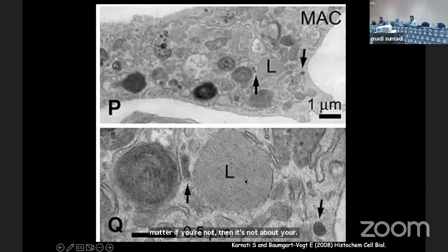So one of the difficult parts of TEM is that you need a very good understanding of cell biology. Because when you cut it and look at the microscope, you don't know where you are. You don't even know anything. You need anatomy, histology and cell biology, and then you can understand where you are. So doing the work is one thing. You can say 90% is the laborious work, and another 90% is actually interpretation. It's the most difficult part.